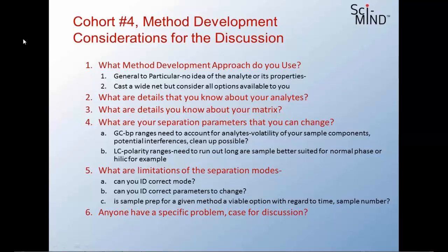And then essentially, if it's a sample prep for a given method, in a lot of cases, a lot of us think in terms of maybe what would be needed up front. A lot of times it makes it a lot easier from the analytical point of view if you do your work up front in cleaning up the sample, especially if you're trying to do quantitative work. We talked about internal standards, and also Nick mentioned standard addition. All of these things will help, but you have to really make sure that you have a good selectivity in your method. And I guess I don't just mean that you have resolution of an analyte.